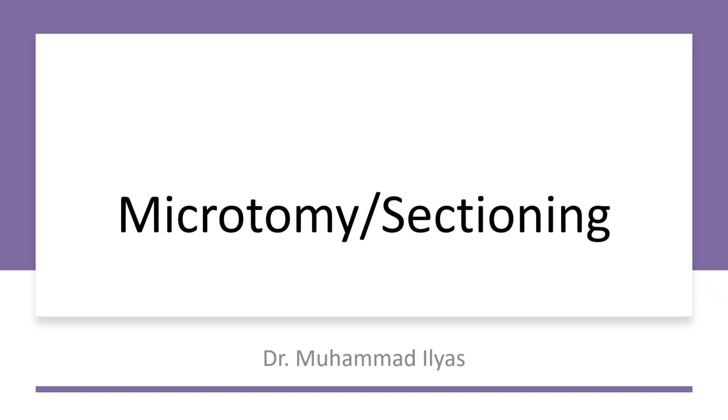In this lecture, we will discuss microtomy. This is next to embedding. So micro means small and tomy means cutting. In microtomy, we cut the tissue in thin slices so that it can easily be observable in a microscope. Now, the instrument which is used for this purpose of microtomy is known as a microtome.